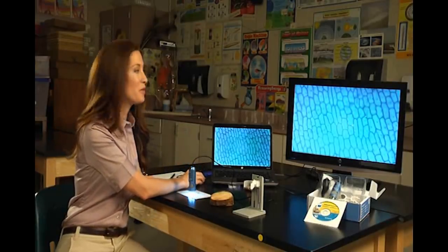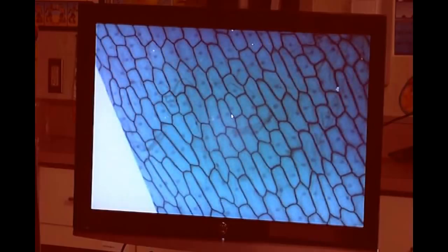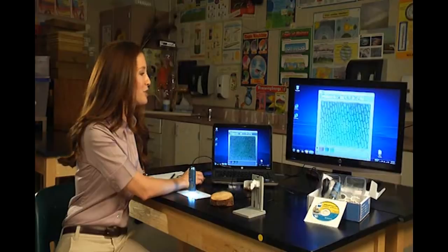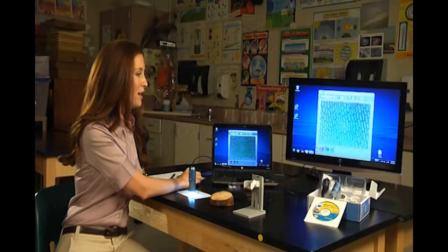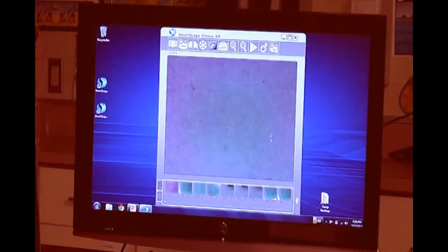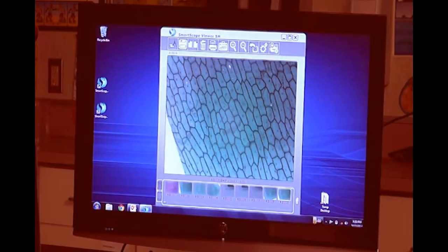In order to go out and view your photos, just double click again. That'll exit full screen mode. And you can see down here at the bottom, these are all the photos that we've taken. So I will just click on this last one and then drag it up into the frame and there's our photo.